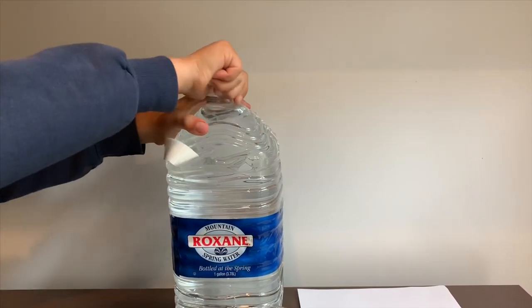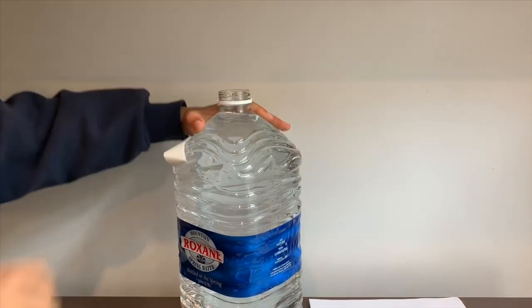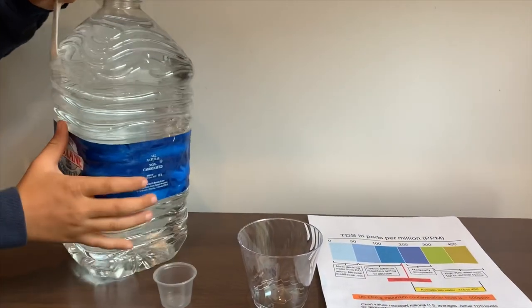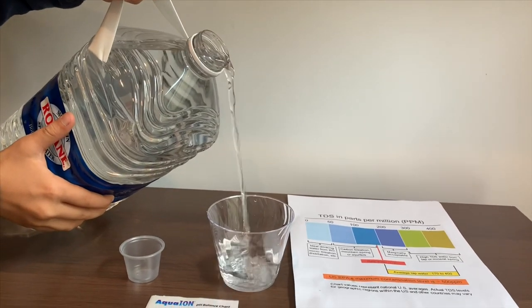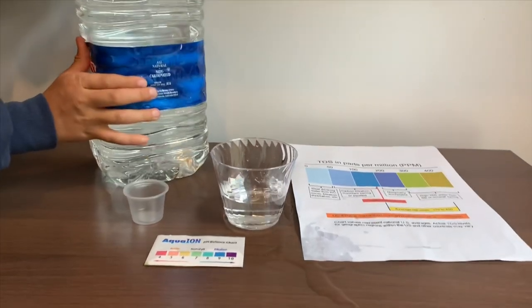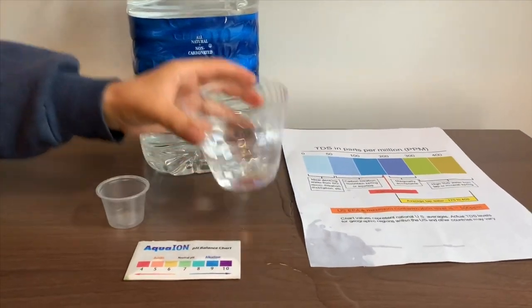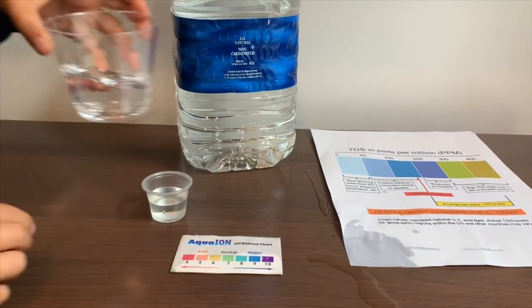Let's test the pH and TDS levels. Let's pour some water in — first, let's pour some water in the pH cup because that's too big to pour in here.